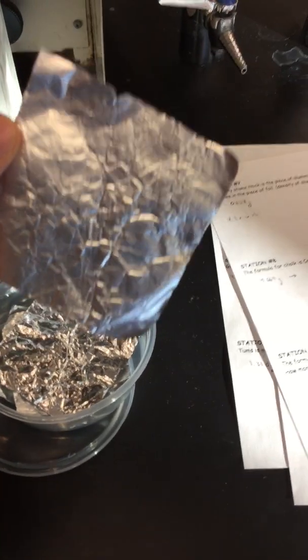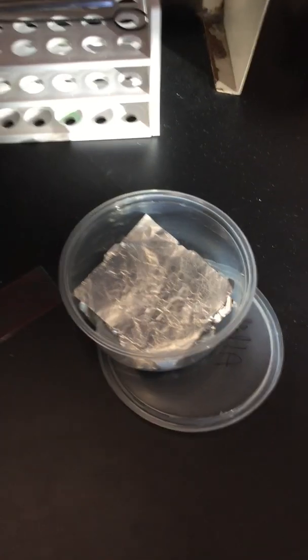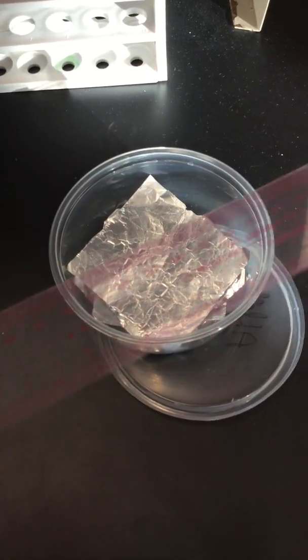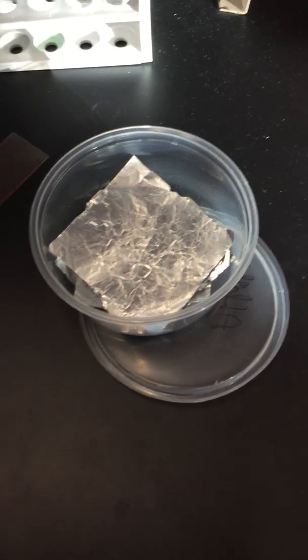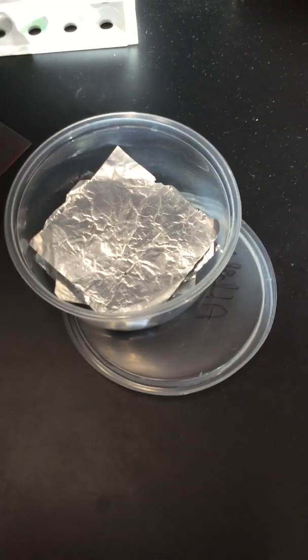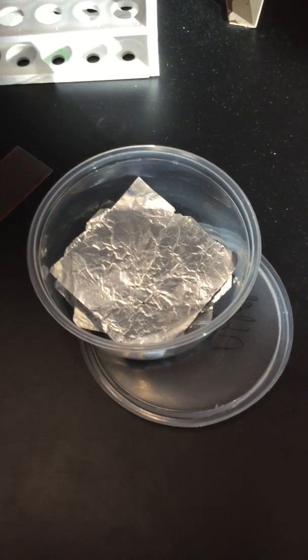Station number 7 has this nice piece of aluminum foil. And this piece of aluminum foil, we're trying to figure out how many atoms thick it is. So I've got some information to share with you that is important as we're figuring out how thick that is. Number 1, I can tell you as a reminder that volume is equal to length times width times height. So I measured my piece of aluminum foil with this ruler, and it turned out to be 7.50 centimeters by 7.50 centimeters. So it's a square, 7.50 centimeters on each side. I can tell you that I also weighed this thing, and it has a mass of 0.237 grams.